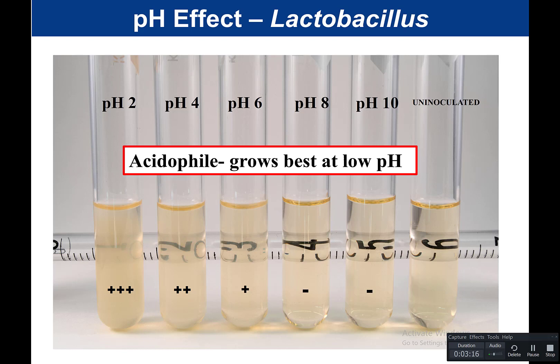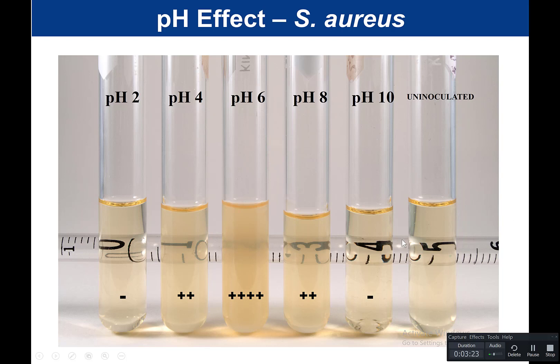If we look at Staph aureus, here is our uninoculated control. pH 10 did not grow, and pH 2 did not grow. At pH 6, you can almost not see the number altogether, so I quantitated that as 4+. pH 8 and pH 4 look approximately the same, quantitated as 2+. Note that this method of quantitation is very subjective — what I call 2+, you might call 1+ or 3+. But the idea is still the same.